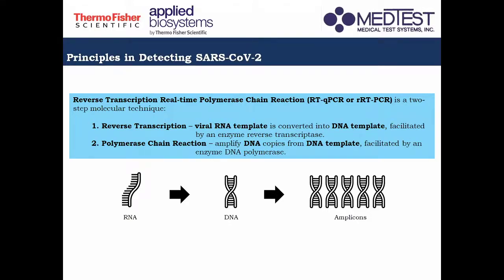So in detail, we use a combination of techniques, which is the reverse transcription real-time polymerase chain reaction technique. No? So it's a two-step technique which involves one, reverse transcription, and number two, polymerase chain reaction.